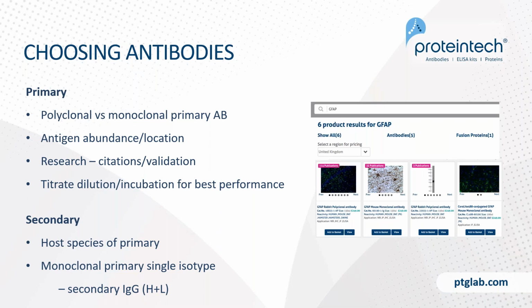A monoclonal antibody is one that has been raised against just one epitope. Therefore, these antibodies have higher specificity and are less likely to cross-react within our sample. Monoclonal antibodies are best if your antigen is highly abundant. And polyclonal antibodies are best for the majority of targets, but especially if your target is less abundant.